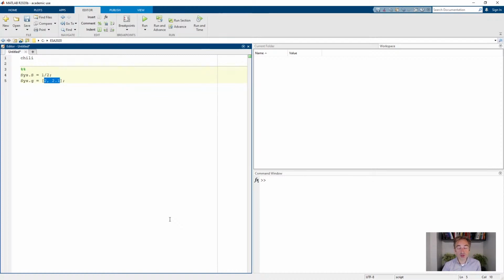And remember, if you only give 2 of the 3 G values, that's equivalent to an axial G tensor and basically means the same thing as specifying 2, 2, and 2.1. This not only saves you typing, but also allows you to keep the Gx and the Gy values locked together. If you were specifying them as 3 separate values, and if you do fitting, then you would have to vary the first and the second separately. But if you know that your spectrum is axial and that these two are identical all the time, this is a much better way of inputting it because you only have 2 parameters instead of 3.